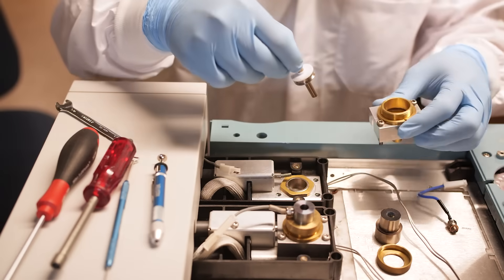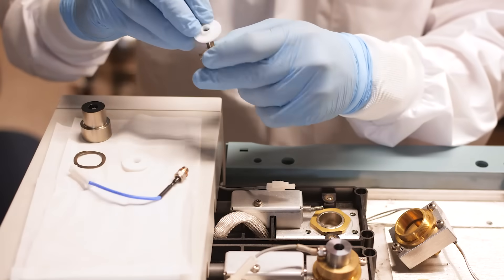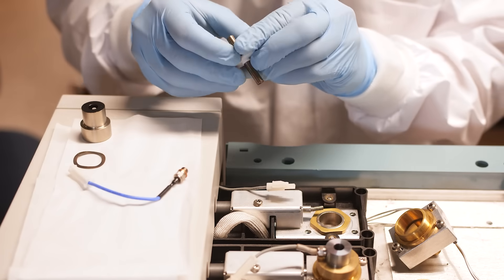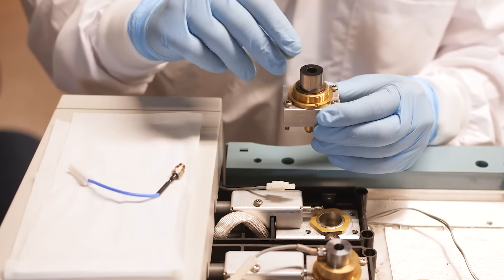Before replacing the new parts, I like to clean out the FID body with a little bit of methanol. Once this is done, we can replace the castle, the PTFE insulators, the collector, and the rubber housing gasket.